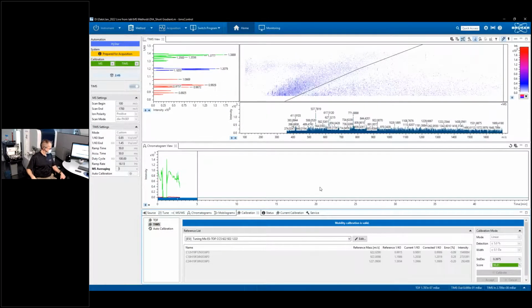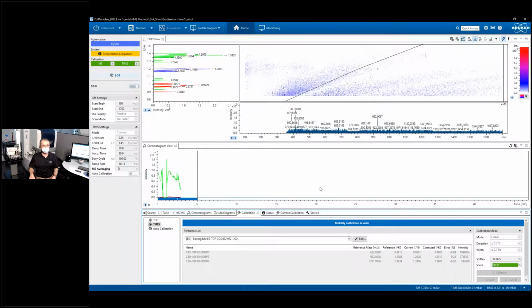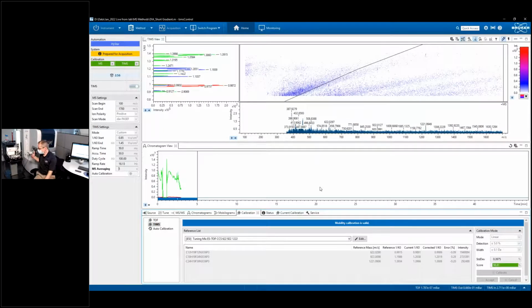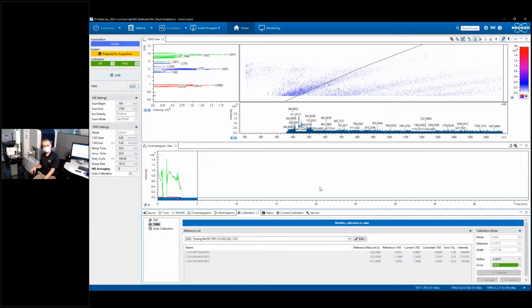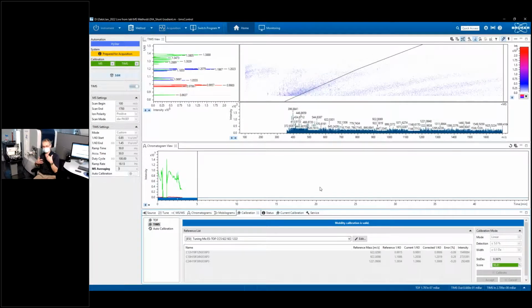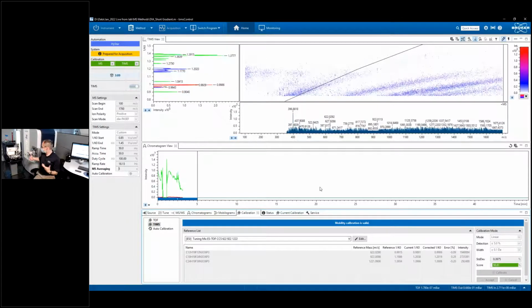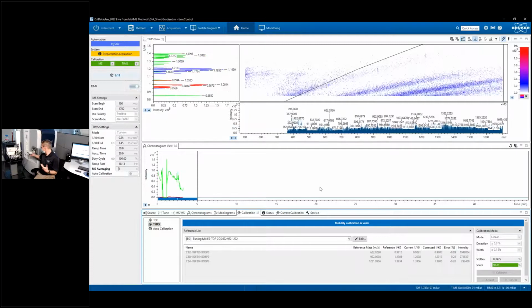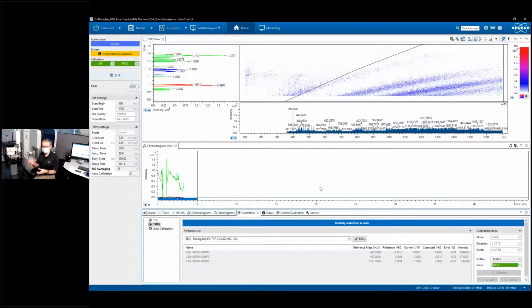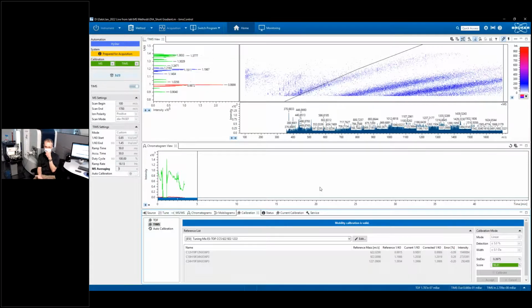So yep. Great. I also realized we didn't actually get around to answering the question about routine maintenance either. Yes, the only two things you have to routinely look after is the captive spray source itself, because of course this is where we're spraying our samples, and so this is the first thing that will get dirty. So this is a very simple thing to clean. We just remove this front of the source here, and we just rinse that with some formic acid, isopropanol, and then dry it with nitrogen and put it back in. It's a 5-minute process.